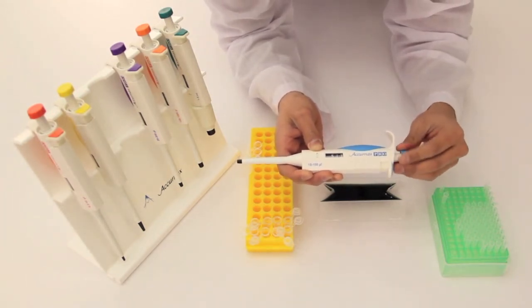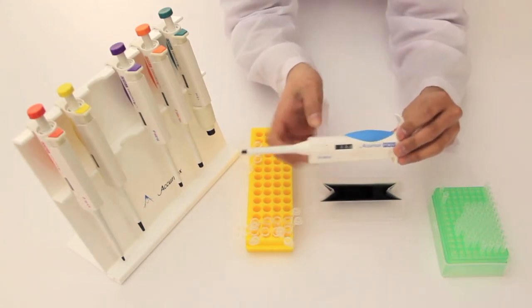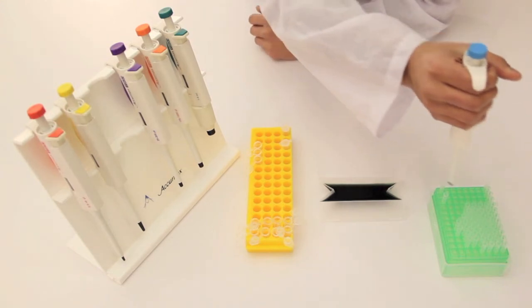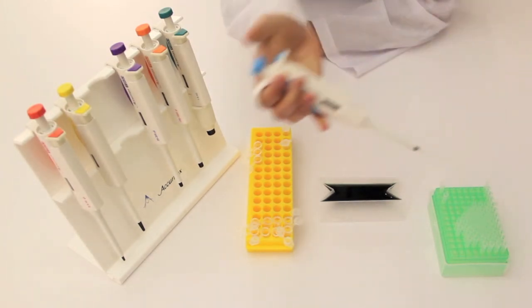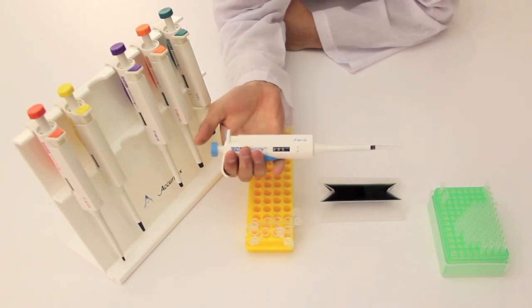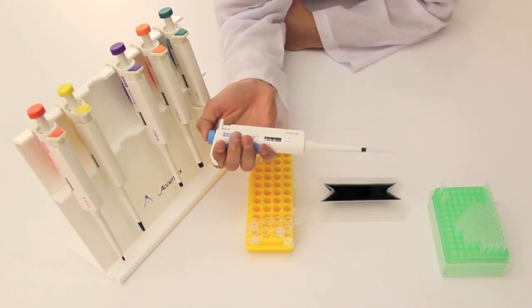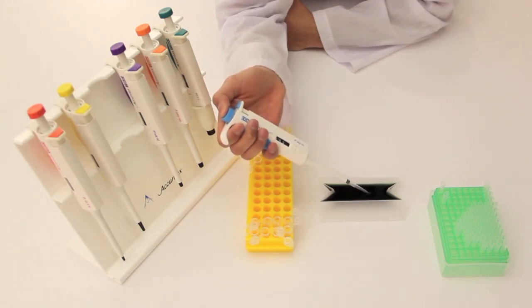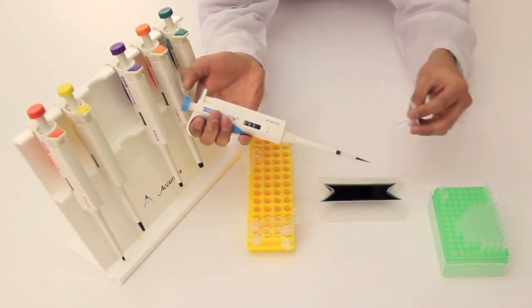Once you're at your desired volume, we'll do the same thing that we did with the AcuMax Junior pipettes by inserting the pipette into the tip. Now to draw out the solution, you want to press the knob down to the first stop, inject the tip into the solution, then release the knob to draw out the solution. From there, you can transfer it into your sample tube.